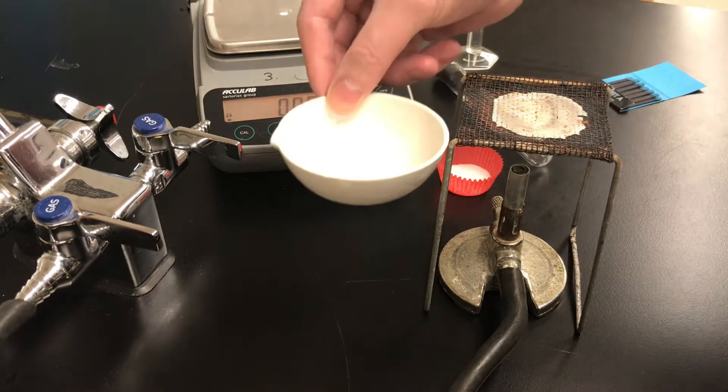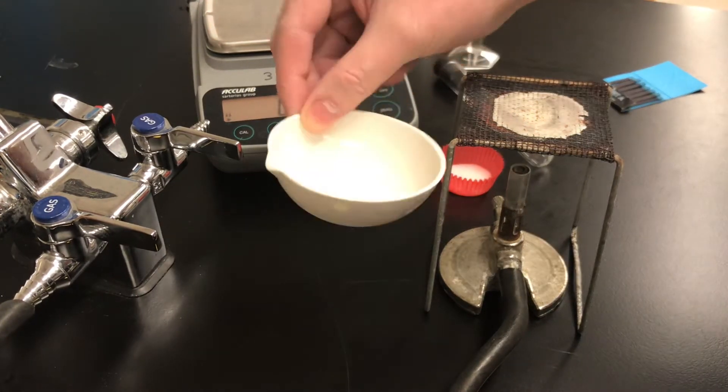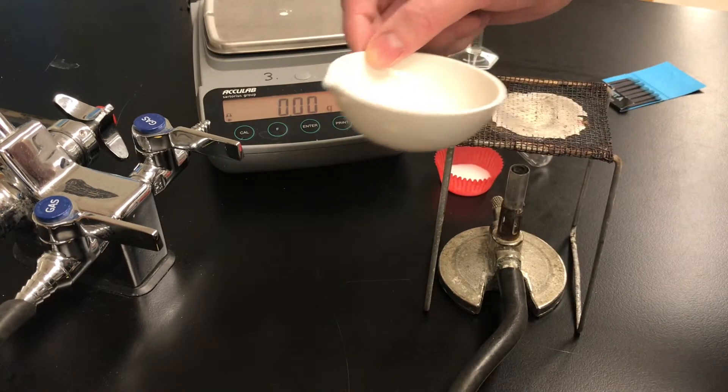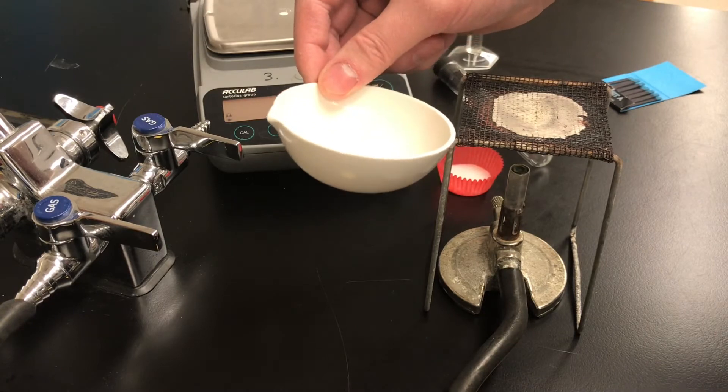We have an evaporating dish. An evaporating dish is just a white porcelain dish with a little bit of a lip on it. You heat it and just like the name sounds you evaporate liquids from it.